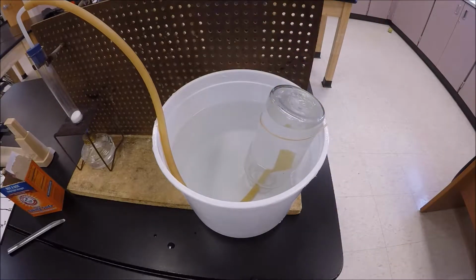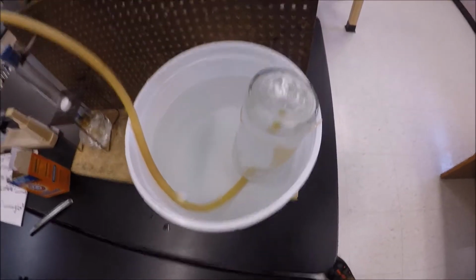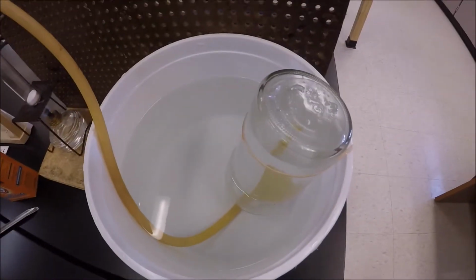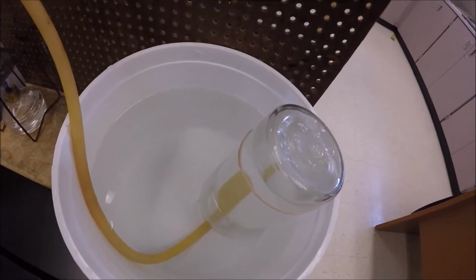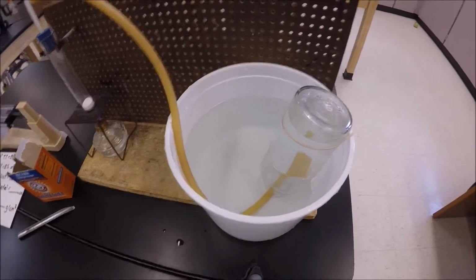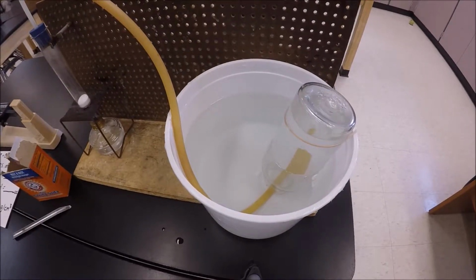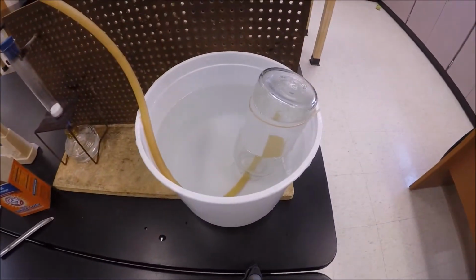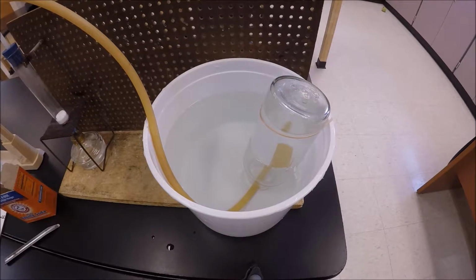But now you can really see the bubbles are cranking along. You can see from the side that it's starting to displace. I'll turn you sideways here, but it's starting to displace quite a bit of liquid. So I've got to be careful here. Again, we're just heating up that baking soda over there. I don't want to let the gas fill up the bottle so much that the gas starts to push out into the bucket itself. You can see there are no gas bubbles in the bucket itself. It's all going into the glass bottle.